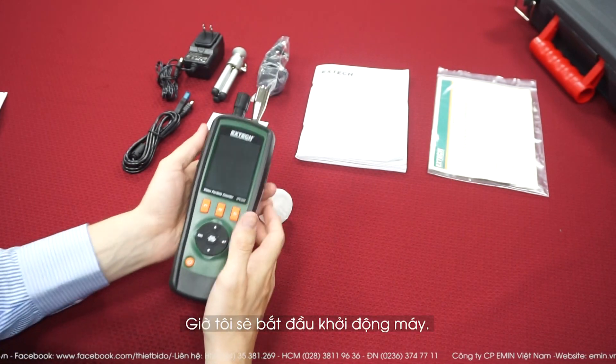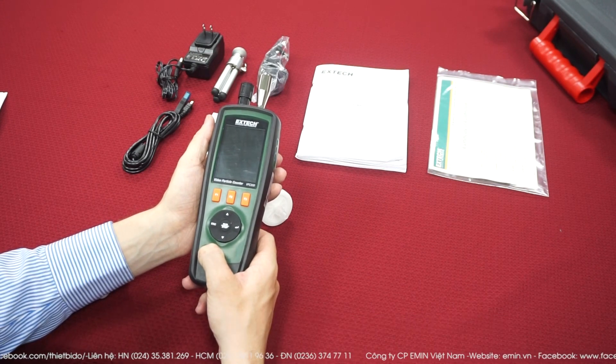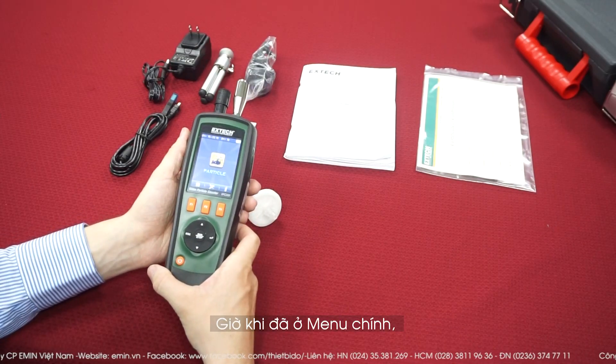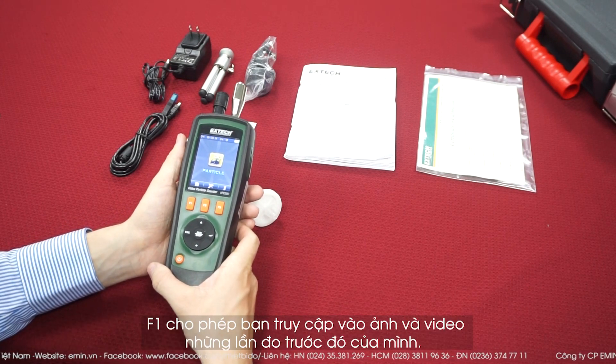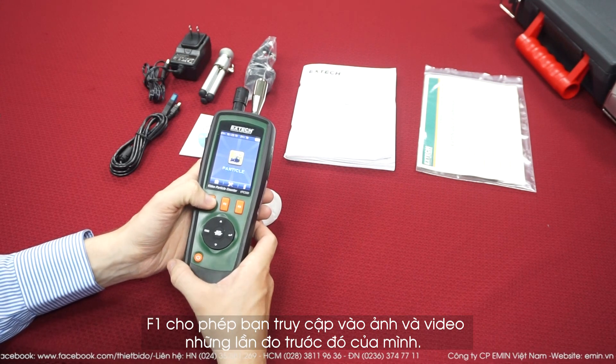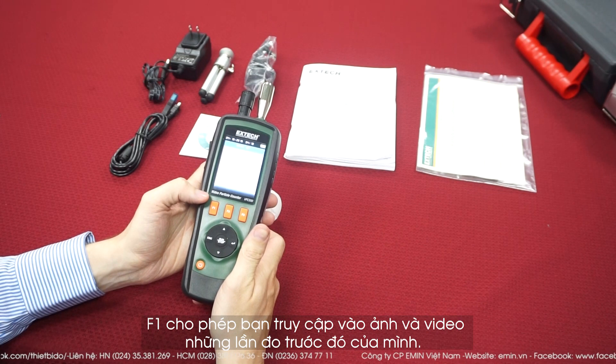Now I'm going to turn it on. To turn it on, you must press and hold the power button for three seconds. Once you're on the main menu, with F1 you have access to the pictures and videos you have taken — so you have the pictures, the videos, and every measurement you've made.